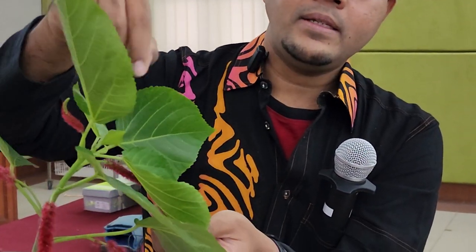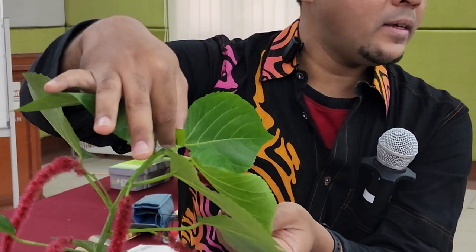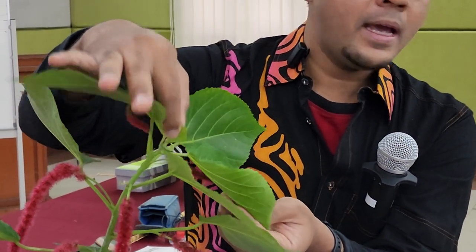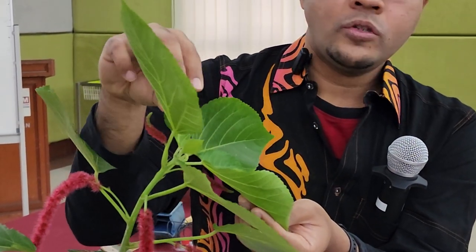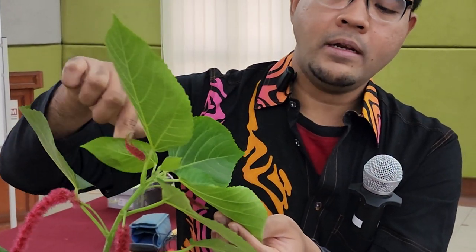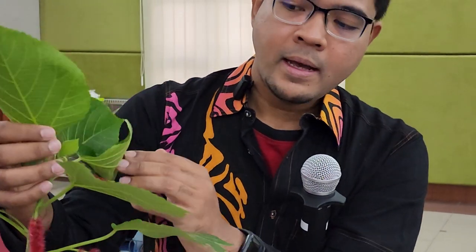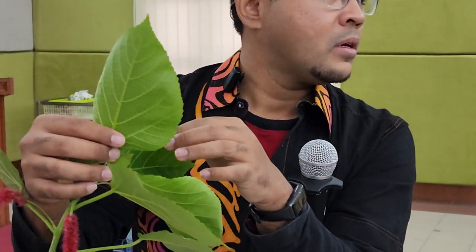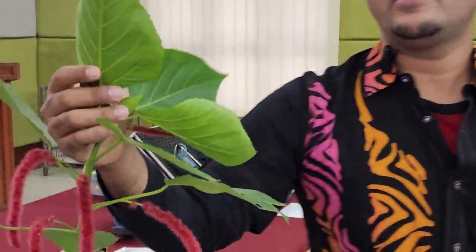So this one, you don't call it a leaf. This is what we call primordia. This is also kind of primordia, kind of leaf. So we don't regard this as a leaf. We still call it primordia. Okay. This you can start calling expanding leaf. So I said from 3 to 5, right? So you start counting. 1, 2, 3. Actually, starting from this one until number 5, you can use. So to be safer, use the youngest, which is this one. Use this one. Okay, clamp this one.